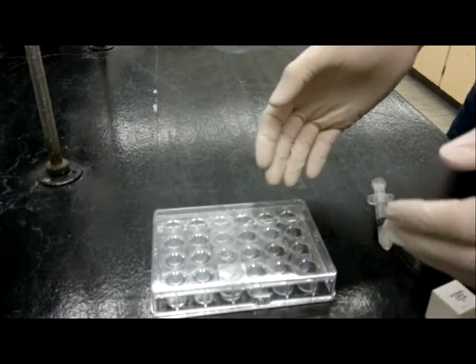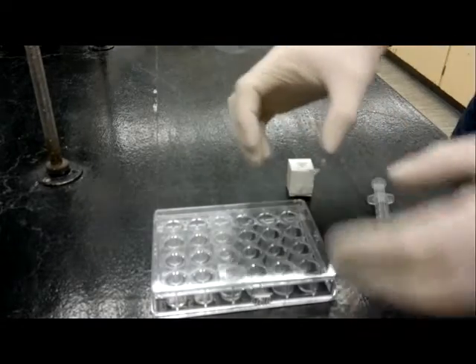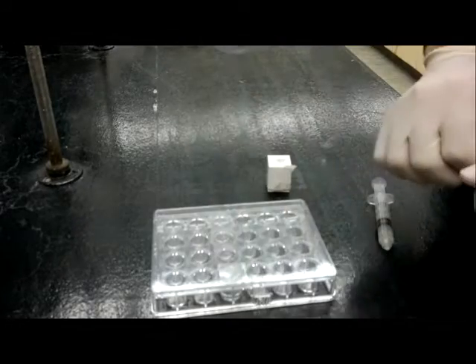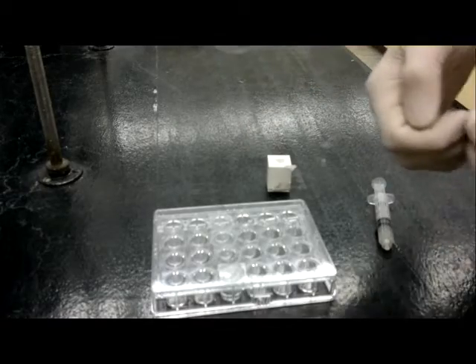It's a little bit different from a tissue culture plate, which you may have seen previously. The wells are a little bit more separated, and they're just the right size to allow these cover slips to sit over top of each of the wells, which are important because that's where we're going to be performing our crystallization.